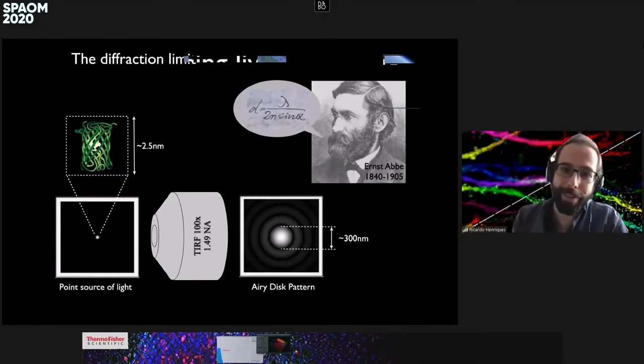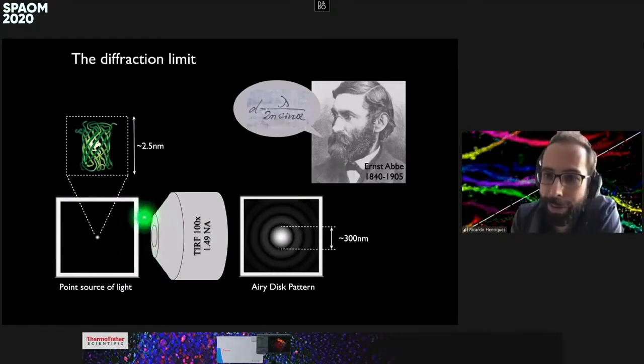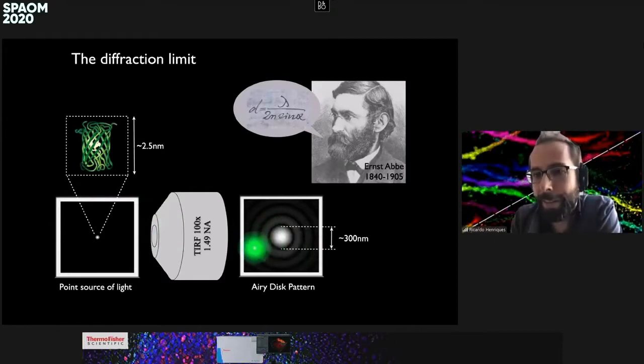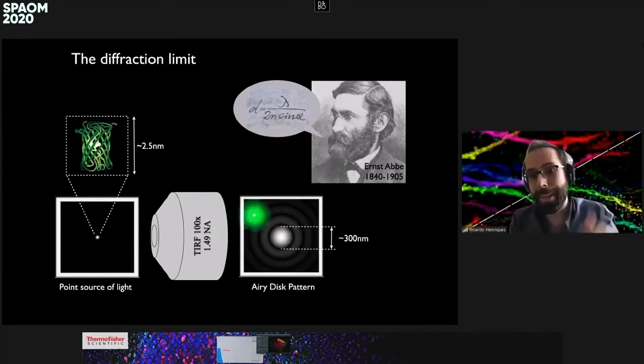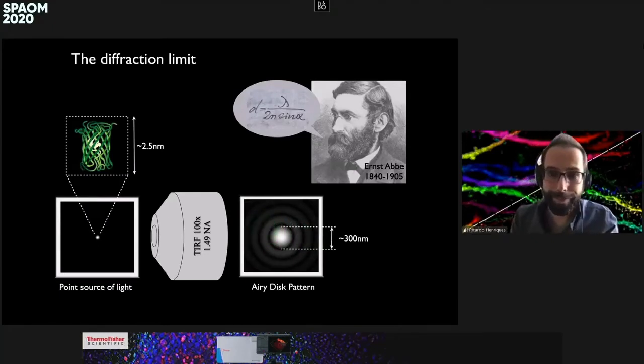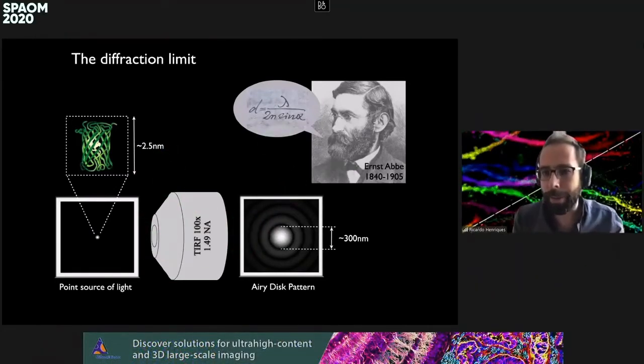The difference now is that the aperture is circular instead of being that 1D slit. Because this aperture is circular, you get the same broadening that you saw before, except instead of being in a single dimension, it's completely radially symmetric. But it's exactly the same process. It's this diffraction effect, which happens whenever you have an aperture, that defines the resolution limit. Every point source of light becomes broadened, and you cannot distinguish those points of light anymore.